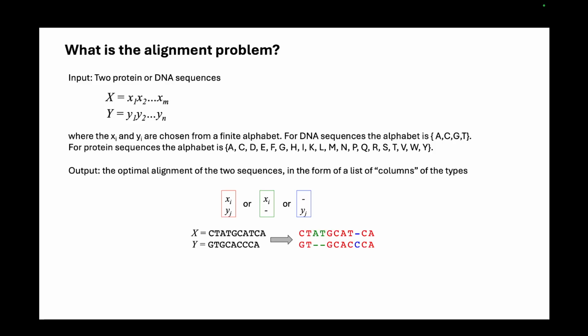But obviously, when you're working with biological data, there are certain things to keep in mind. It's not just two separate strings that you are trying to match. These are DNA sequences, and they follow certain rules. The mutation that you're considering here has to follow certain rules. You need to have further evidence than just matching up the next element. That's why you skip the previous one. So it's not as simple as that, but this is how we begin.